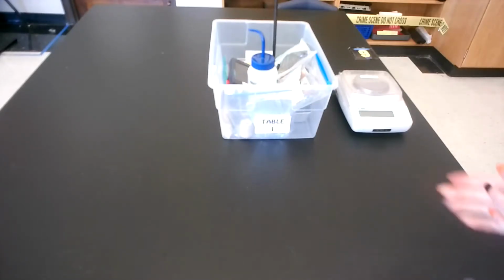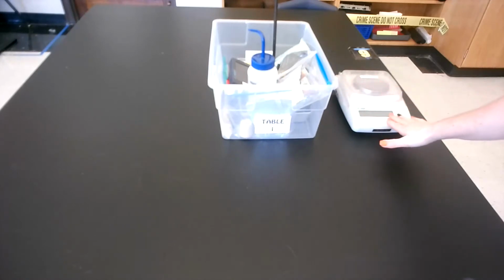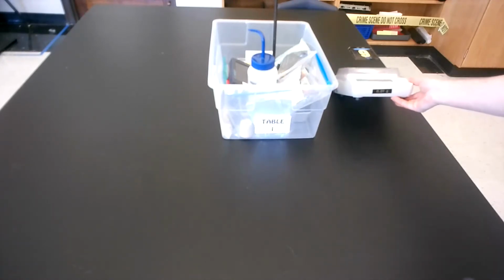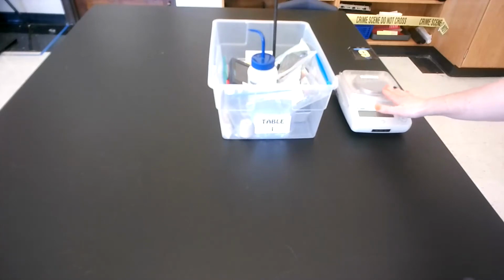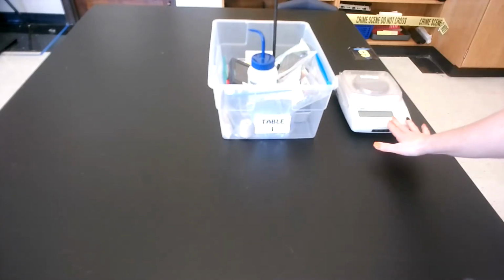Energy Lab, you're going to get a tub, and you also need to get an electronic balance. And these actually go up to the 100th because we need to be very precise. So we just need to be very careful with these. These are very expensive balances. You'll be using these in chemistry next year.